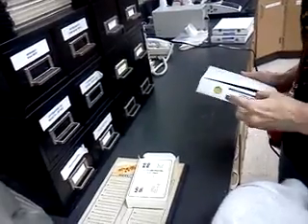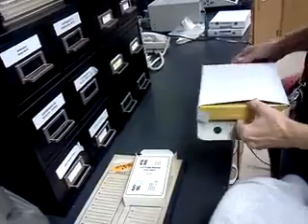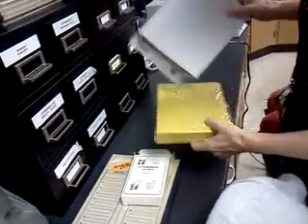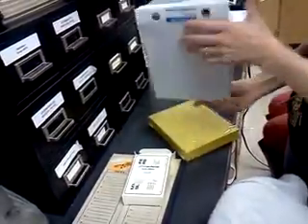So I don't know if you're interested in this. Then there's another thing we do, depending on the kind of stain that you do. We also use these. This is where we put our cryosections, by the way. So you need this little box number as well. Okay, so if you want to do it this way, you need these boxes.